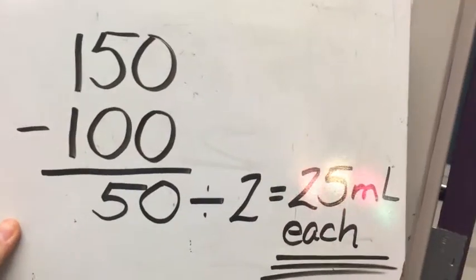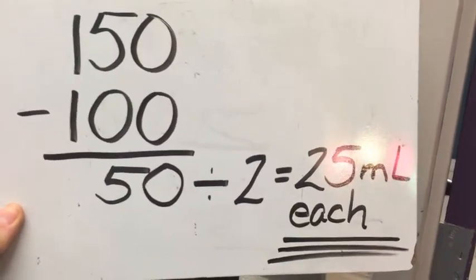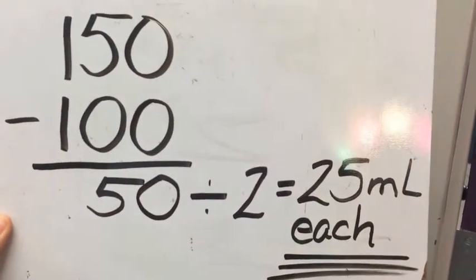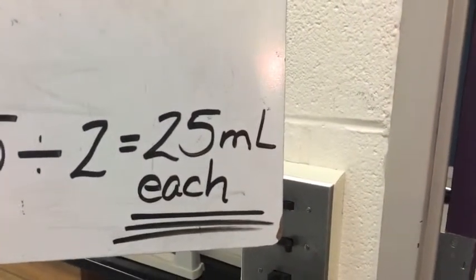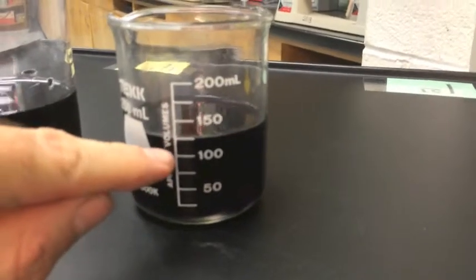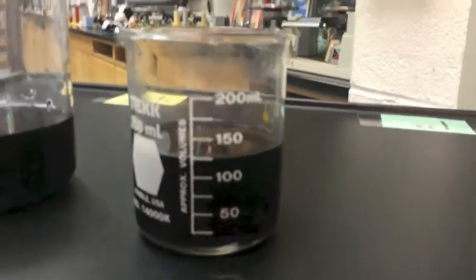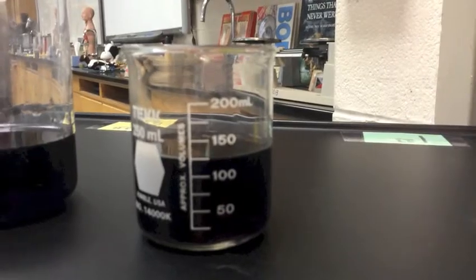Using a formula, you can take the top one, 150, subtract the bottom one, 100, and that gives us a total of 50. From there are two graduations. We divide that number by 2, and that tells us that each graduation is worth 25 milliliters. Because of that, that means each of these is 25. So there's 100, that would be 125, and that would be 150. That gives us a total of 125 milliliters in this beaker.